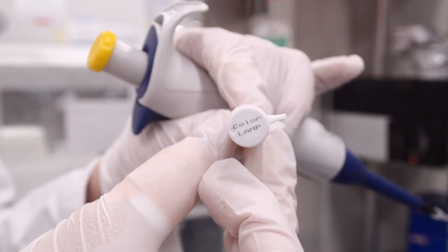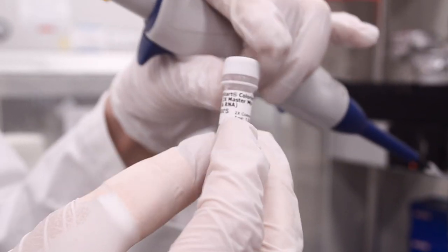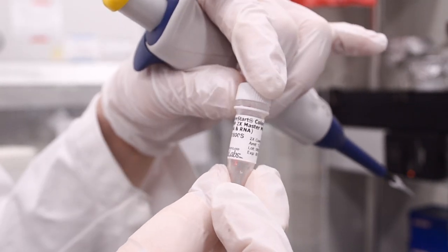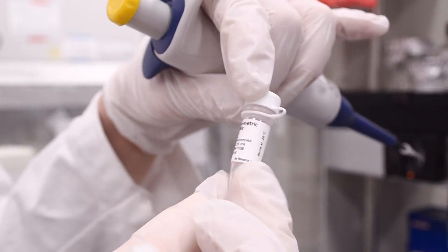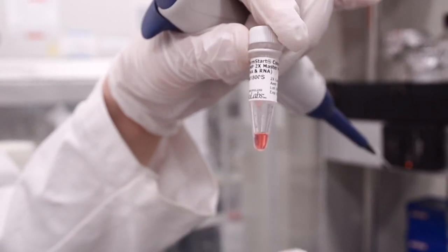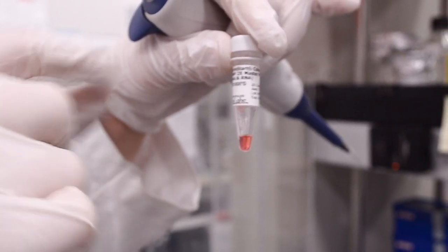The colorimetric Warm Start is not completely thawed, only enough to take out the amount needed. This is because the Warm Start has an enzyme that activates when it's warm. For our reaction to work well, we don't want that enzyme to activate until we get our sample to the heat block.